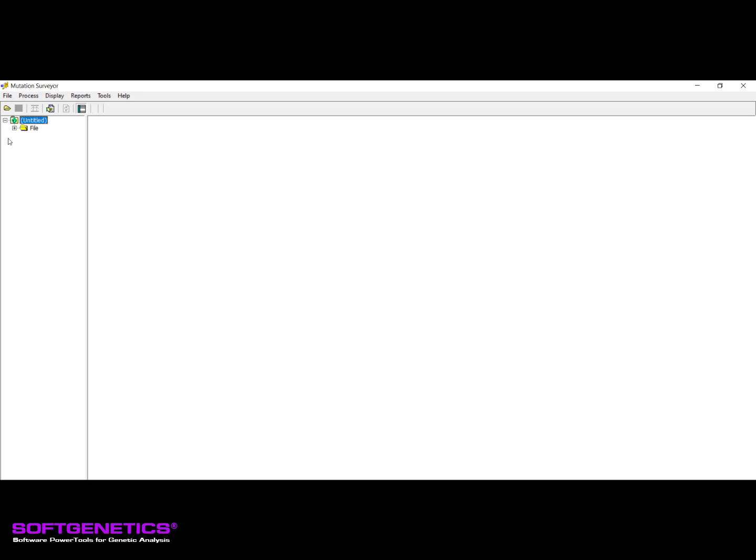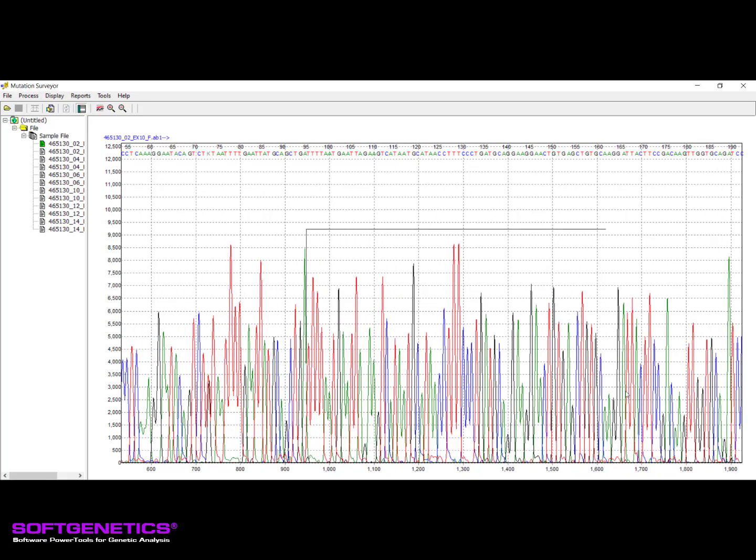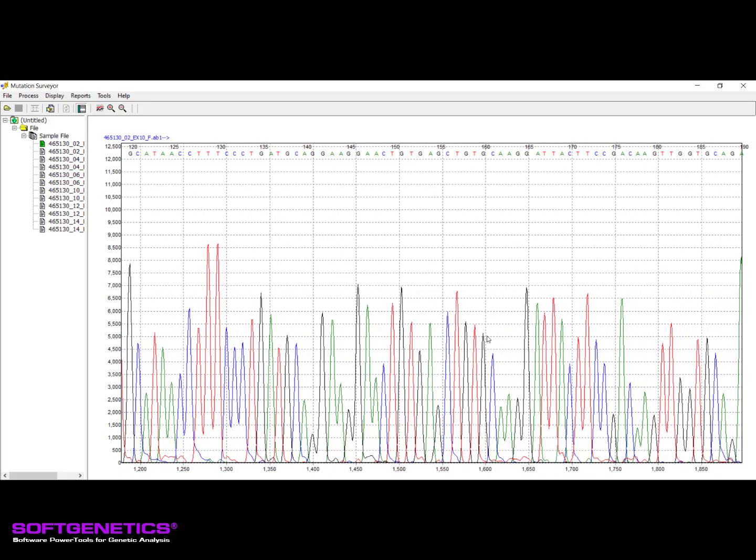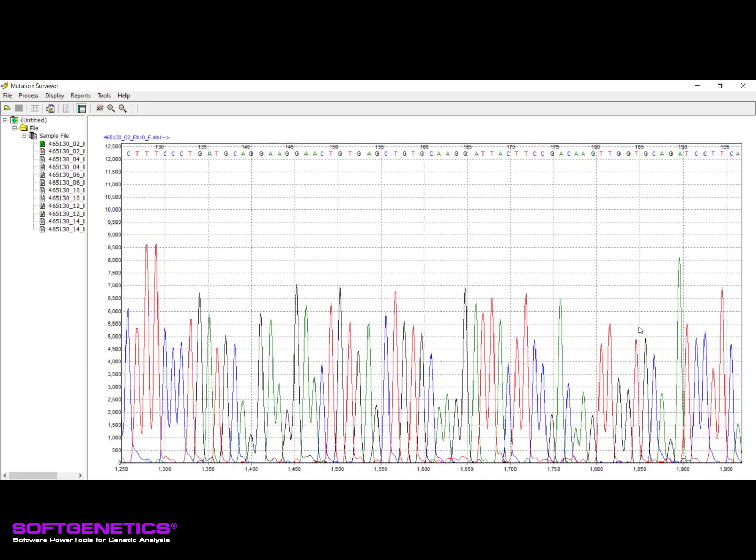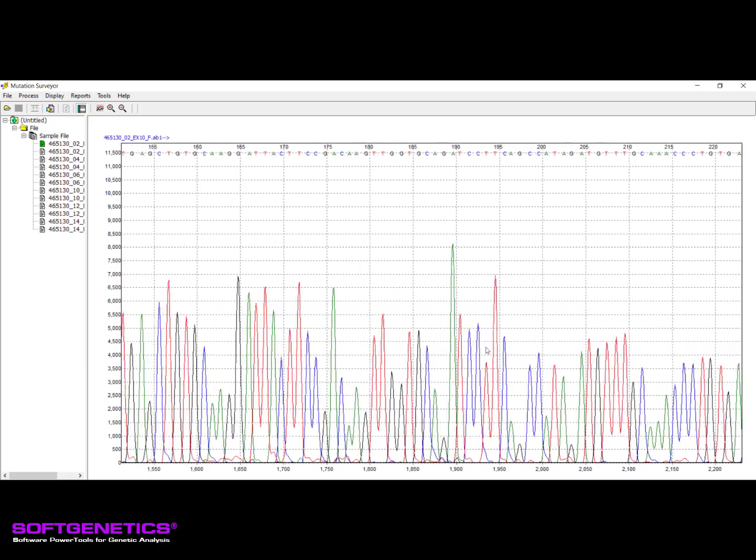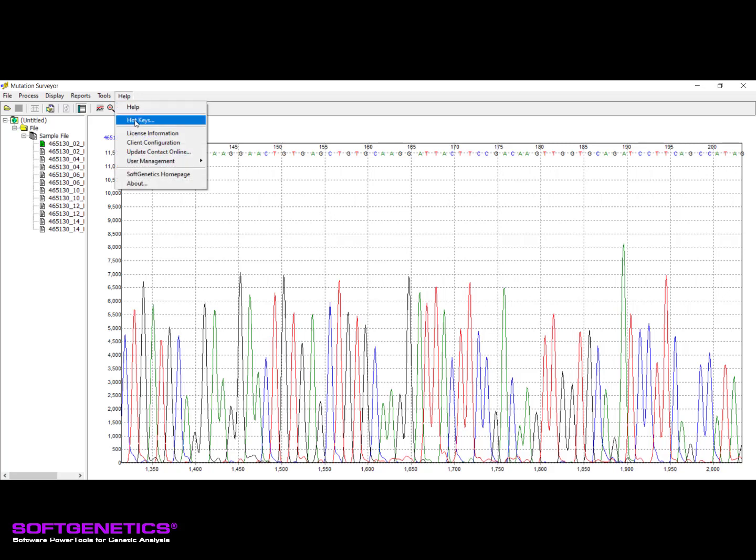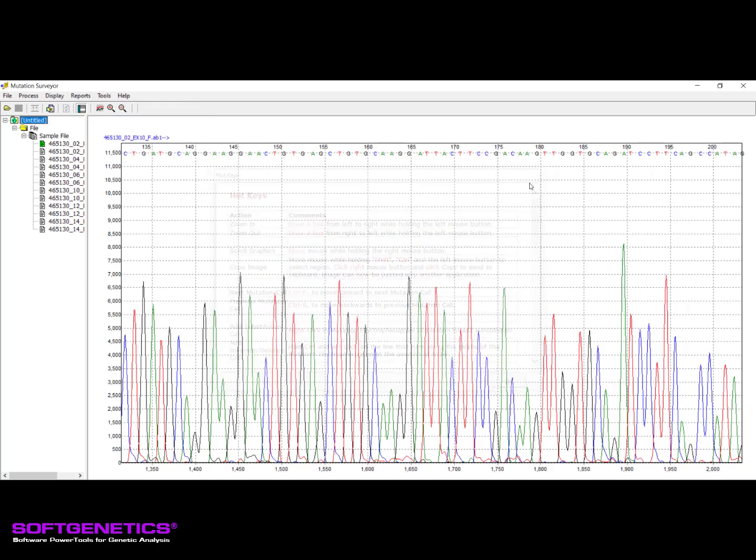If you would like to view your trace files prior to running the project, you can do so by expanding the File Browser menu located on the left pane and double-clicking on the sample you would like to view. To get a closer view, zoom in by holding down the left mouse button and drawing a box from left to right around the region you want to view. Scrolling is achieved by holding down the right mouse button and dragging the mouse left or right. Please see the Hot Keys option under the Help menu for additional mouse and keyboard shortcuts that can be used throughout the software.